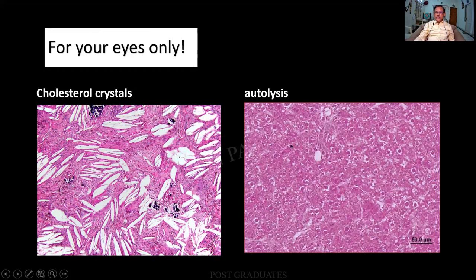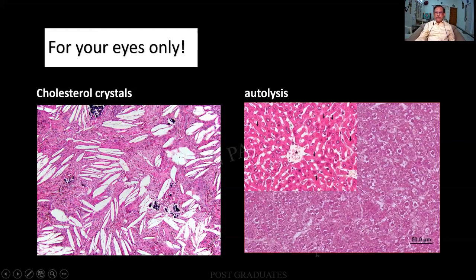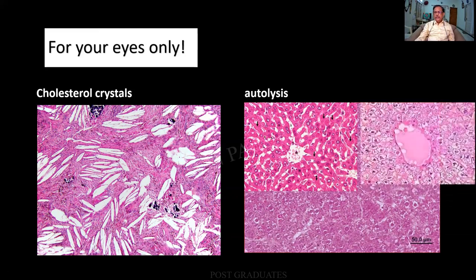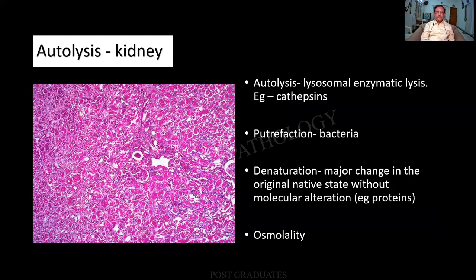Secondly, you cannot appreciate the nucleus or the cytoplasm, let alone a gland. Autolysis has already set in and sometimes a diagnosis of free of tumor or tumor-present cannot be given. In the liver, one can see normal radiating cords of hepatocytes from the central vein, but here autolysis has started — there is bulging of the cell, rupture, and 100% complete autolysis in another specimen. In the kidney, hardly anything is recognizable — maybe some outline of a glomerulus, but it is a futile effort. Autolysis is caused by lysosomal enzymes such as cathepsins; putrefaction by bacteria.